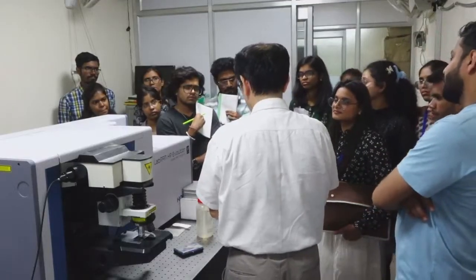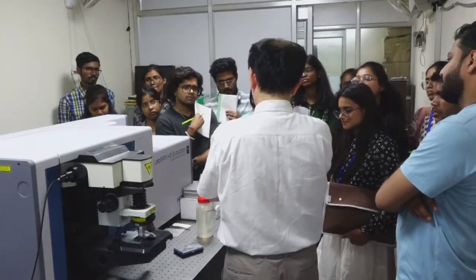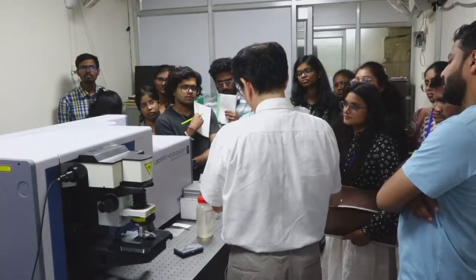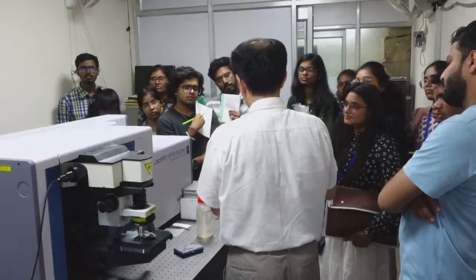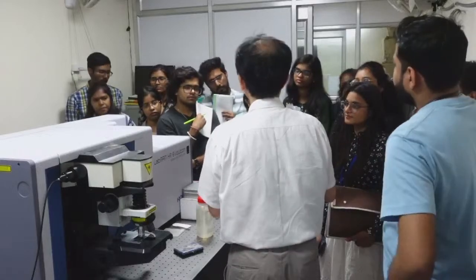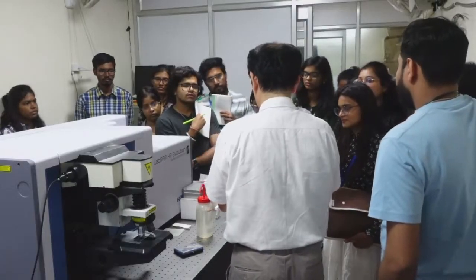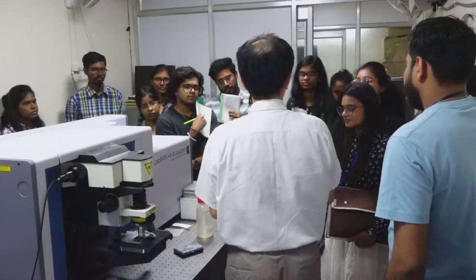Okay, stronger light damages the sample. So it depends. In the case of a semiconductor or some hard material, it's possible to focus, it is safe. When we want to measure skin or some living cells, with strong light it will be burned and become carbon. So it depends on the purpose, and the highest laser power or smallest focal point is limited by the condition of the sample.